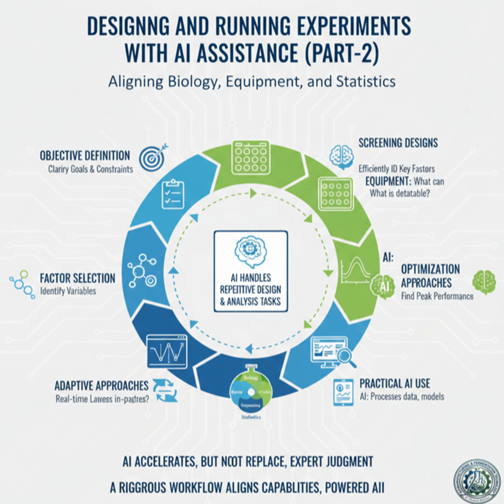Generate a screening DOE for 8 media factors in yeast fermentation with realistic ranges. Straightforward enough. Sure. And the AI will churn out a beautiful table in seconds. But then comes the most important step, the group critique. The lesson just hammers this point that you cannot just take that table and run with it. You have to look at it and ask, what would fail in a real lab?